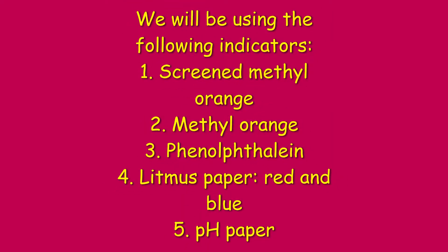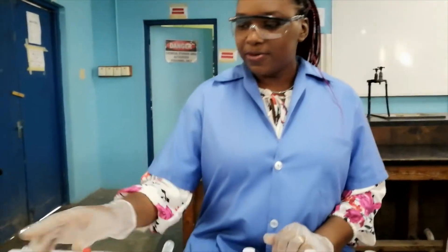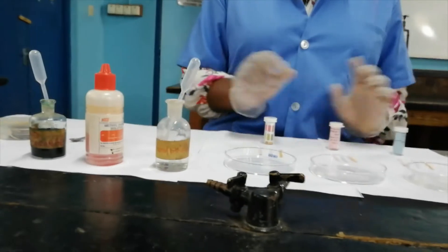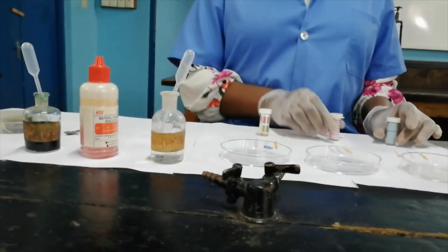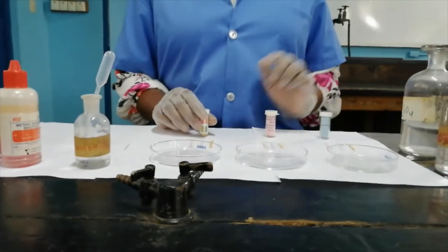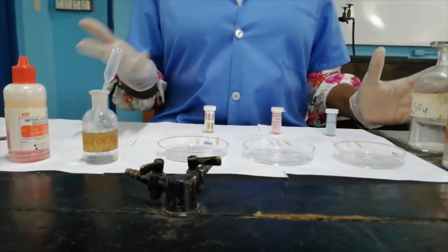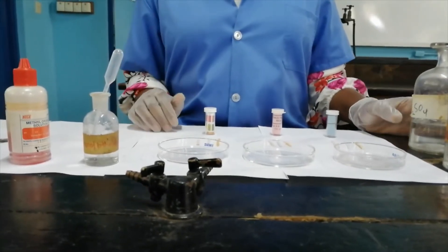We're now going to look at the colors of different indicators in acids. We have five indicators: screened methyl orange, methyl orange, phenolphthalein, litmus — red and blue litmus paper — and pH paper. I want to show you the effect or color that each indicator will show in acids.